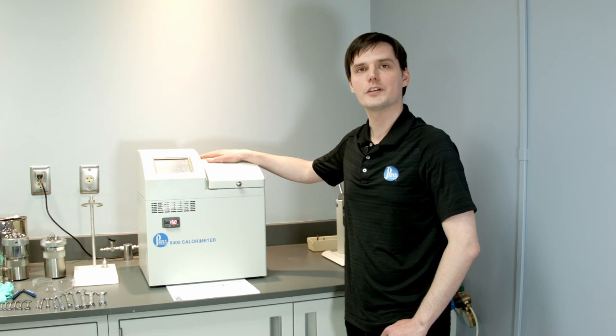Hi, this is Andrey and welcome to Parr Educational. Today we will do together 500 maintenance on the 6400 calorimeter.